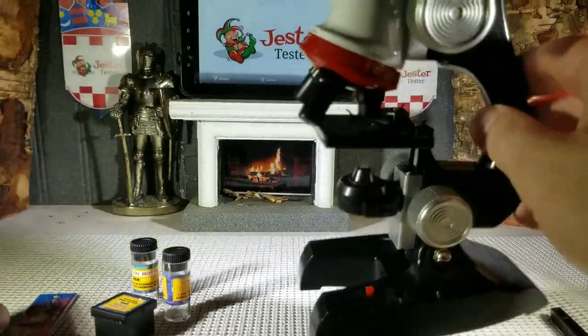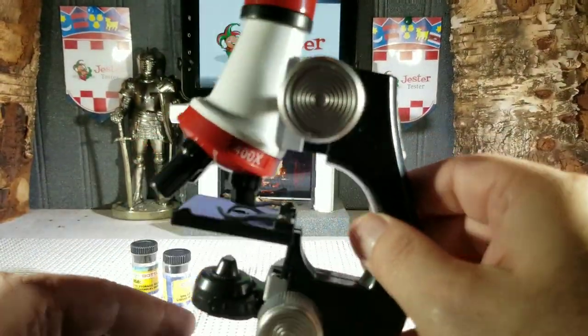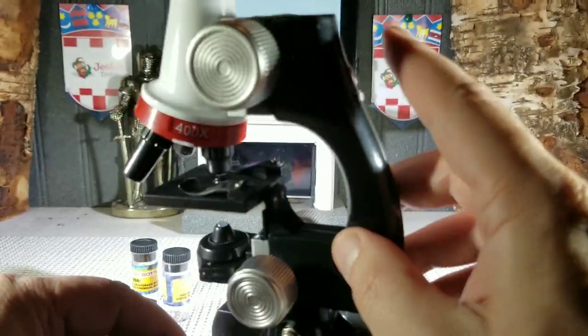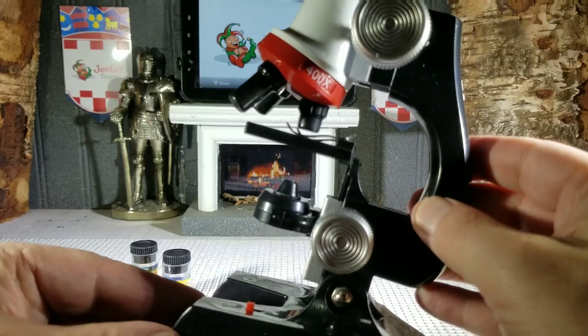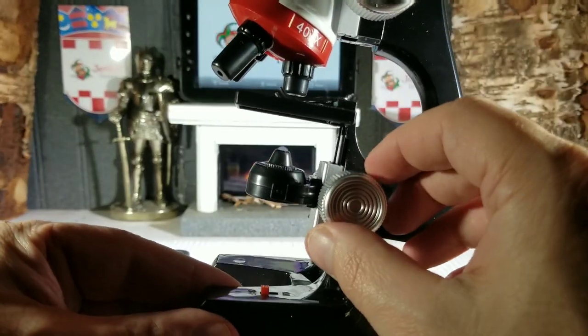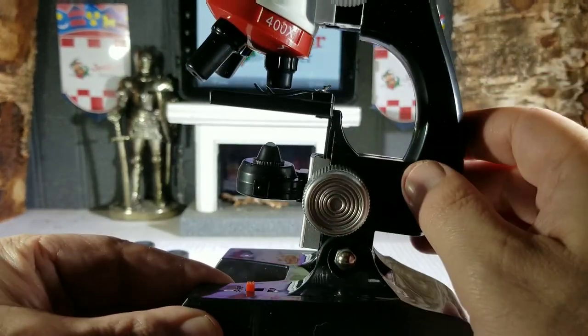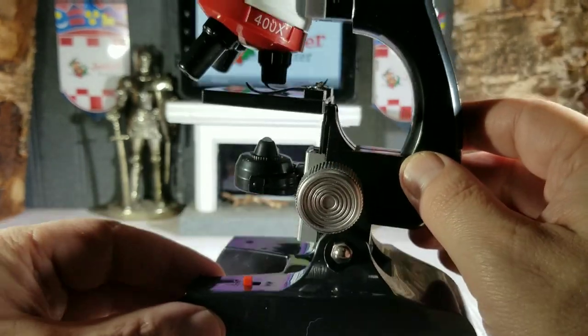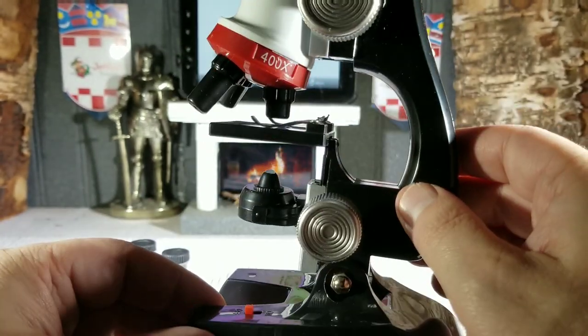Here's the microscope itself. It is done well — like we said, it is toy grade, so it's not the most sturdy. It's not made out of metal or anything like that; it's all plastic, so you do have to be careful with it. But it is made well and it does work extremely well.